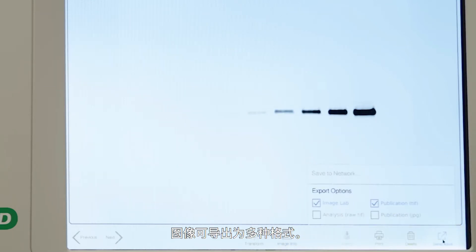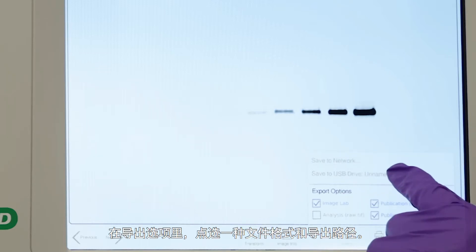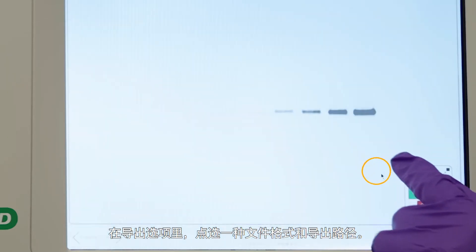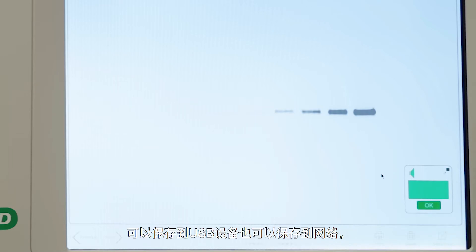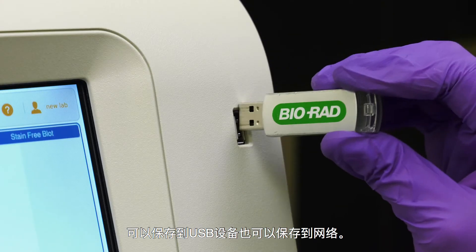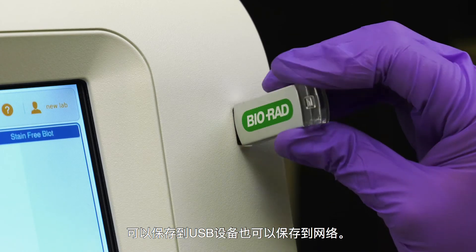Tap the Send/Save icon to select the file format you want. You can export images in multiple file types. Under Export Options, tap a file type and the destination, either saving to a USB drive or to the network.